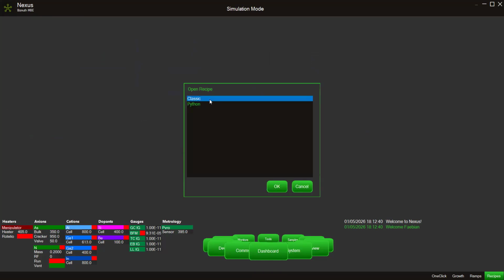In this video, we will focus on Classic, a straightforward scripting language for creating basic recipes with a well-defined command set. To hear more about Python, a more advanced way of doing recipes, for more complex materials and structures, please refer to our Nexus Python scripting video.